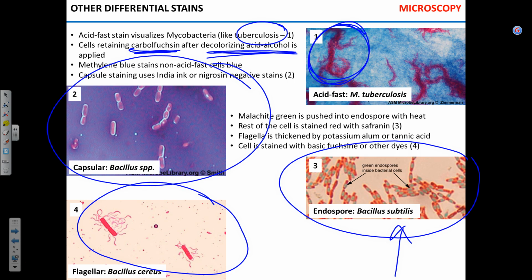So in real life, flagella is not that thick. You see how big they are? Oh no, they're much thinner. It's just staining that gives them this appearance.